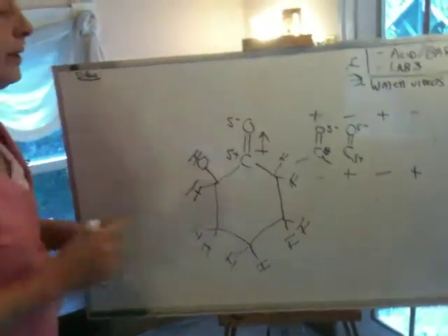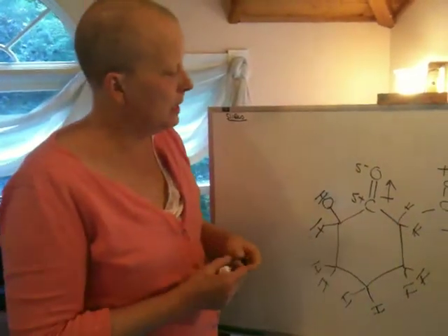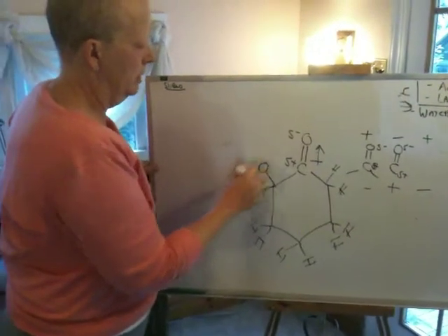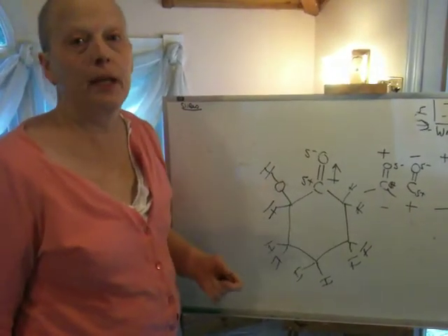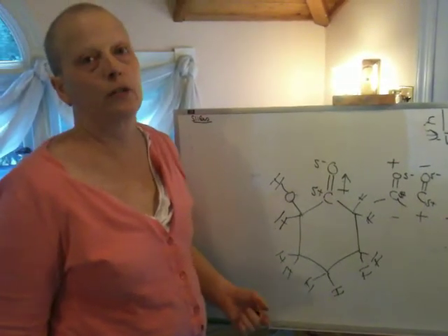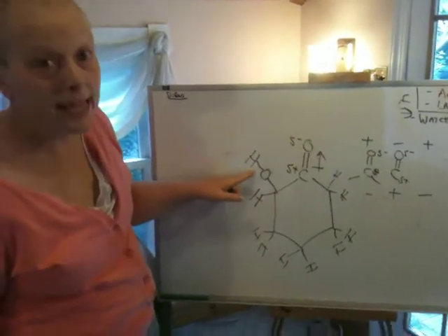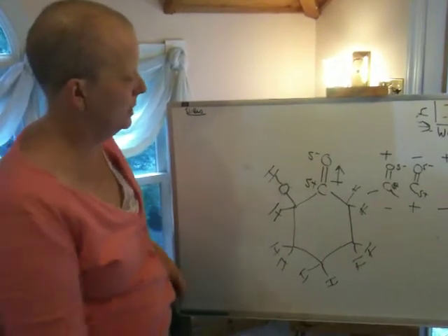Like that. If we had a molecule like this, what would we expect? We would expect, first and foremost, to see an absorption for the OH bond. Now, OH bonds vibrate somewhere between 3,200 reciprocal centimeters and 3,400 or 3,500 reciprocal centimeters. So we'd expect a big absorption for that because that is a really polar bond. What else would we expect?